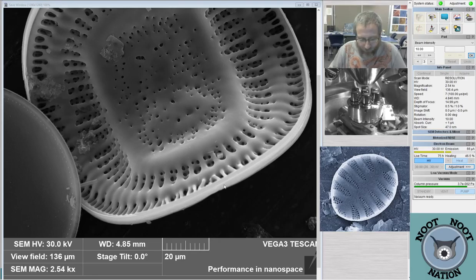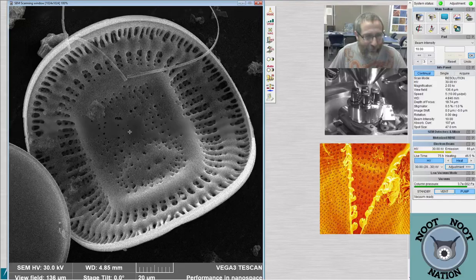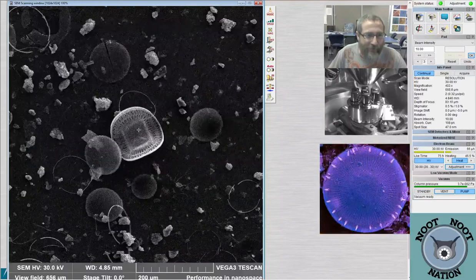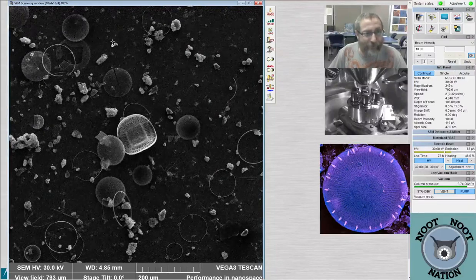This is Campylodiscus. Campylodiscus also happens to be my wife's name on Twitch, her handle, because it's one of her favorite types of diatoms, so maybe I'll bring this one home as a late birthday present for her.